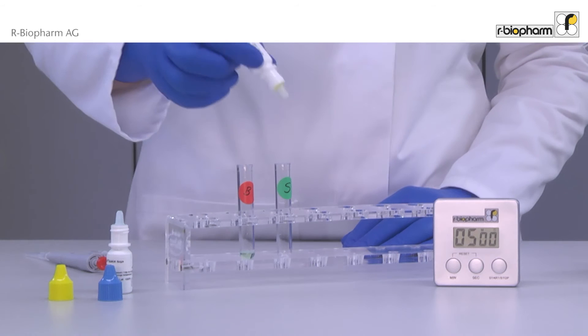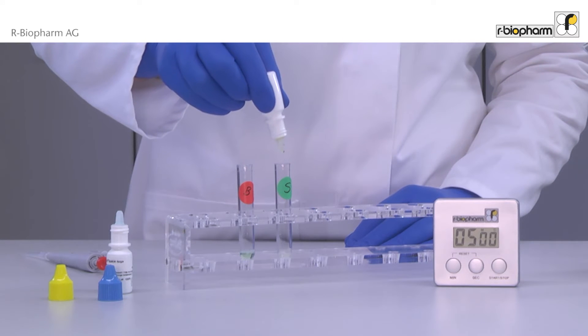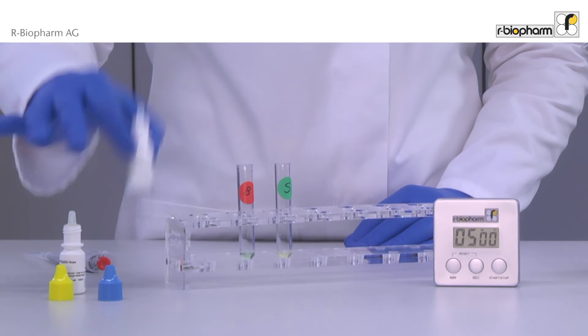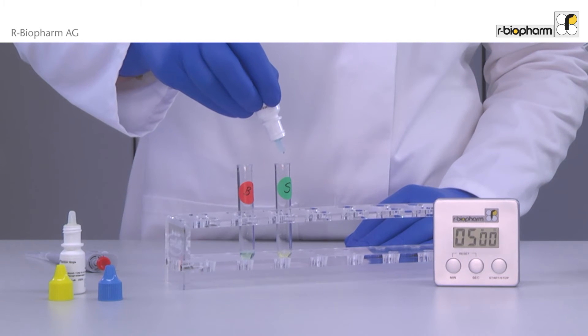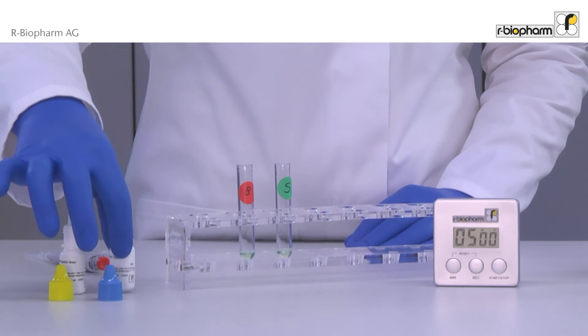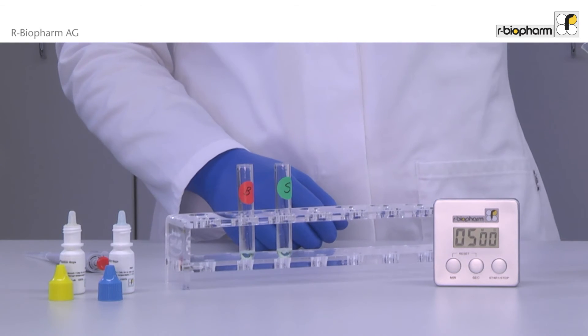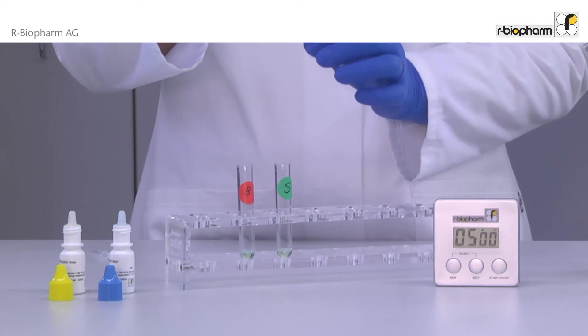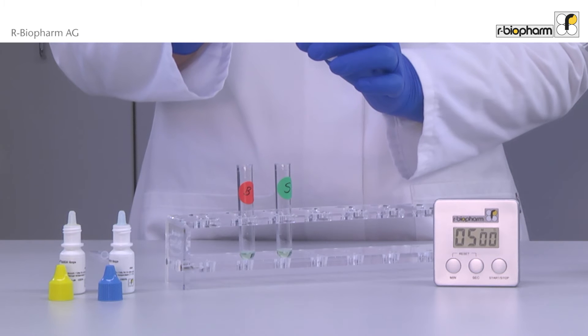Add 5 drops of each conjugate to a 5ml test tube. Then add 150 µl of food sample and incubate for 5 minutes.